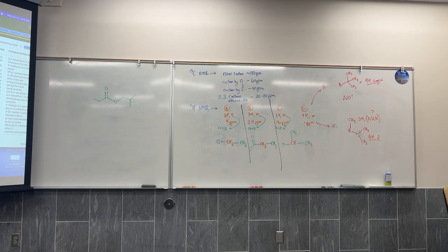I didn't give you a formate, but that would have been cool. Butyl acetate. No, too clean. Look at that singlet. Acetate has a singlet CH3 next to the carbonyl. Too clean. All right, well, if I can't find this soon, you're just gonna have to wait until I figure it out. I'll be honest. I don't know what the mistake is. It's gotta be in the integration.